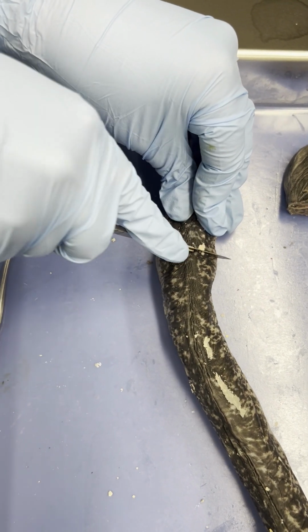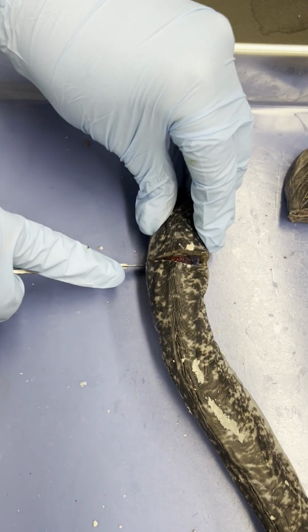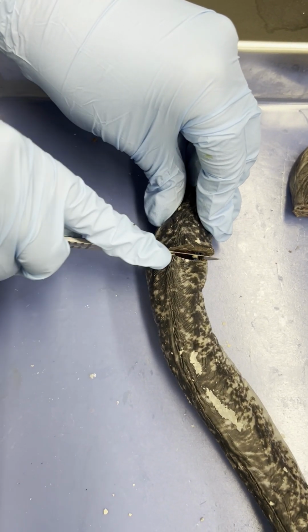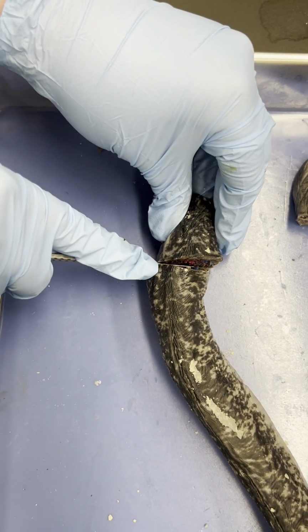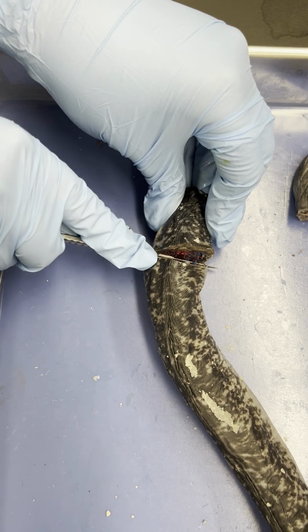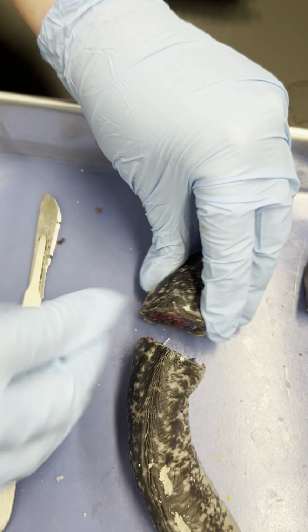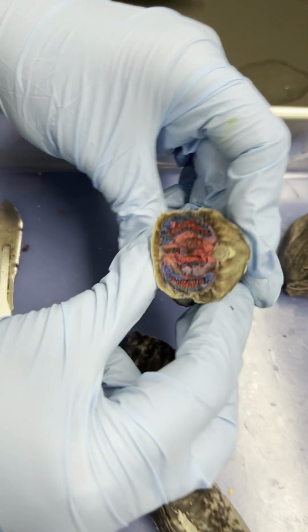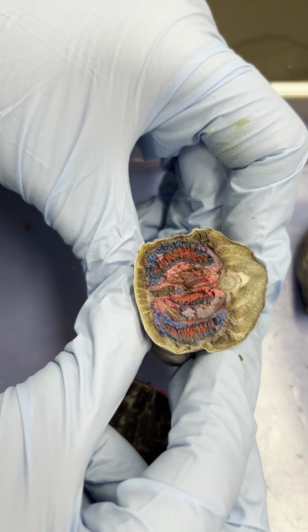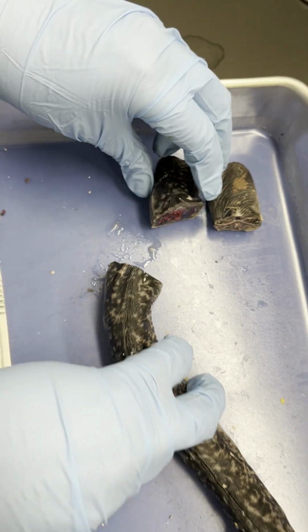And we're just going to try and make a nice cut, as straight as we can without doing too much of a sawing motion, just so we don't harm any of the structures we're going to be looking for. If there is one that you do happen to really butcher, that's okay. You can just make another smaller one a bit further down. Here we go. That's beautiful with the dye. That's a really lovely view of those gill slits.